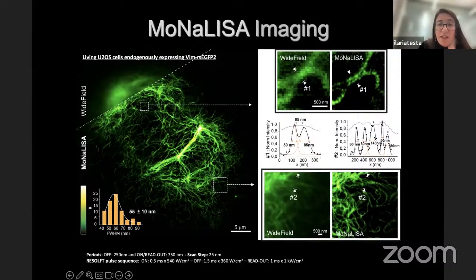You can decide to look at the parameter that you like the most. Sometimes some people like to quantify resolution to see the confinement that you can reach. Others look at the Rayleigh criterion to see the minimal distance that you can still distinguish two spots. Both are meaningful. So here are a few numbers for both. Of course, you can confine up to 40, 50 nanometers, but then when they come together, it's more like 70, 80 nanometers. And that you can actually improve with deconvolution, because then it helps you to deal with the noise somehow.